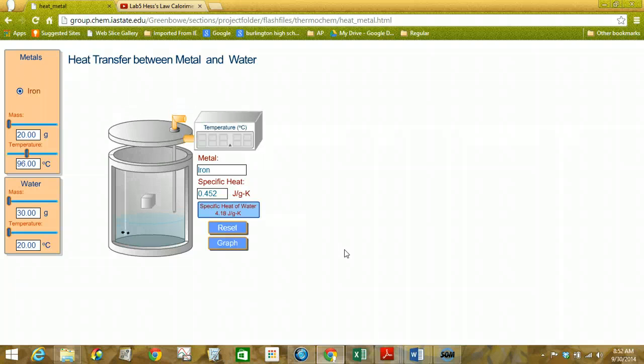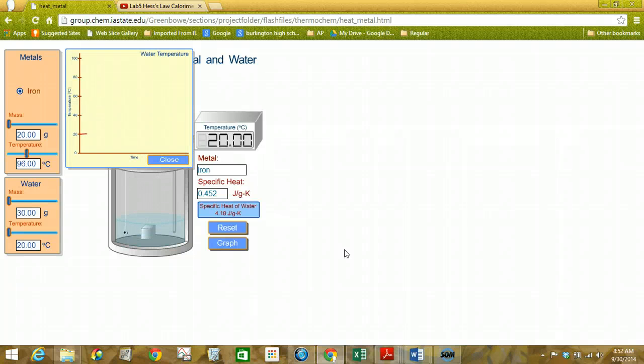So in a calorimeter, usually we have this closed lid. There's a thermometer down into the calorimeter, and there's a stirrer usually to, again, make sure that the heat transfer is occurring evenly between the two substances in contact. And then we're going to wait until the temperature stops changing. In some of these calorimeter experiments, you might see temperature increase, you might see temperature decrease, but whenever the temperature stops changing, that's how we know that the heat transfer is done.